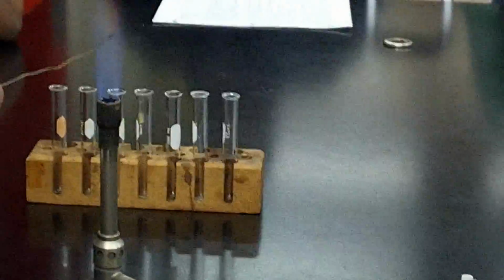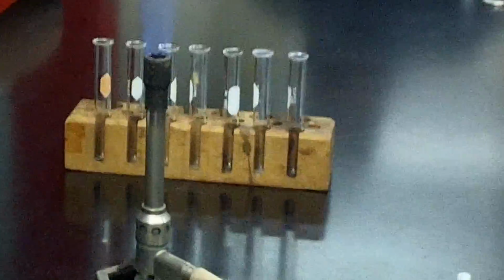And that's happening all the time. As I put this in here, some of the atoms are actually being excited and others are being cooled down. Even though you don't see it on a microscopic level, there are actually some atoms that are cool and some atoms that are hot, depending on the flutter of the flame. All right? So let's see what happens if I test a few chemicals here.